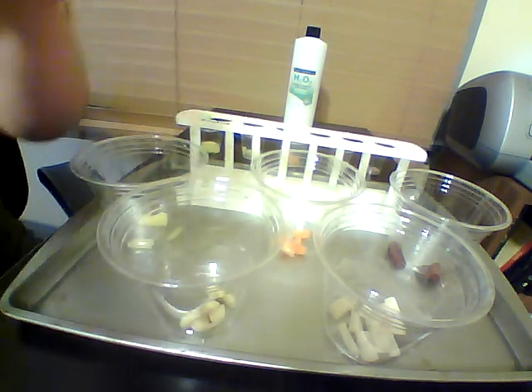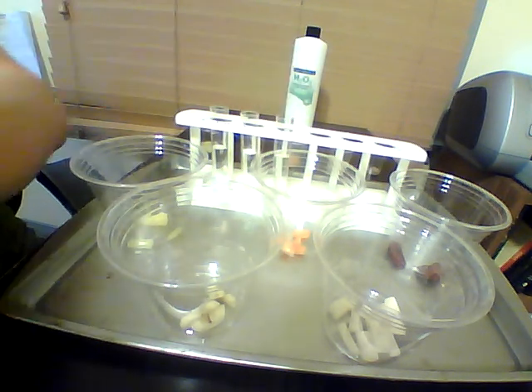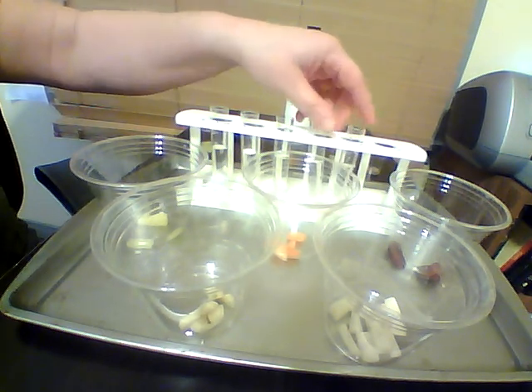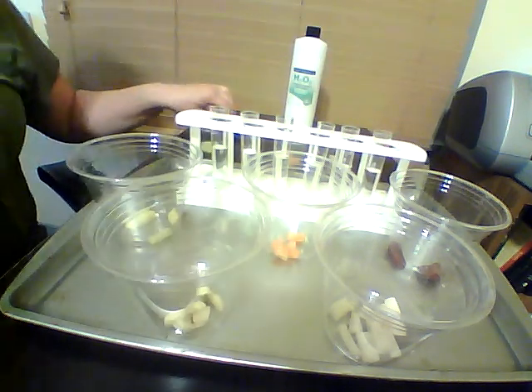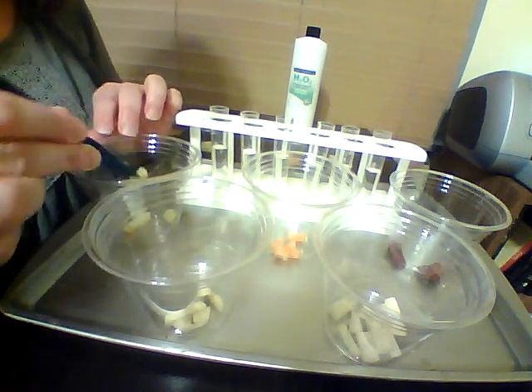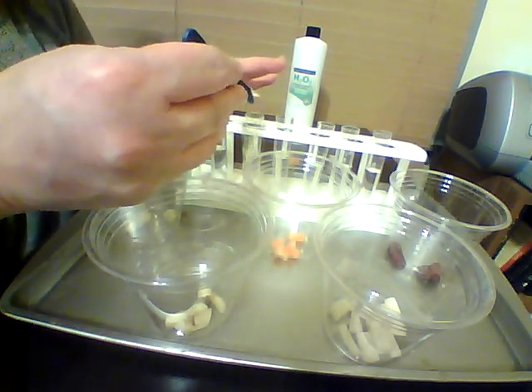So I have here some test tubes that I have pre-filled with some hydrogen peroxide. You'll notice we have 6 test tubes and only 5 sample materials, and that's because one of our test tubes is going to be a control. I have them labeled. Hopefully you'll be able to see that when I slide them forward. The first thing we're going to do is leave this one empty, so that's our control. We're going to drop a pineapple in here and see what happens.